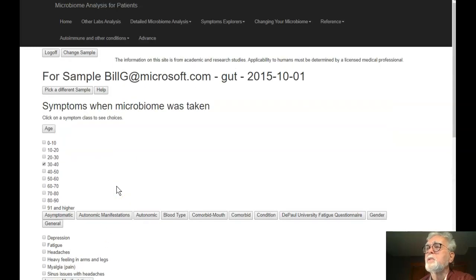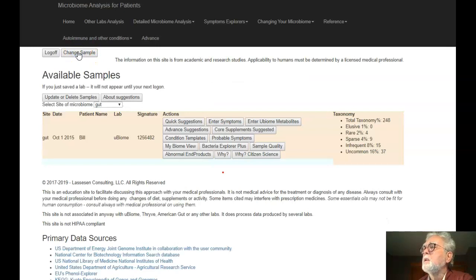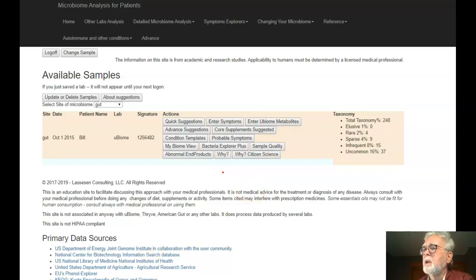The prediction is based on you, a person entering the symptoms after you upload the data. The next one is enter UBiome metabolites — I have a separate video on how to do that. I'm just going to take a look at what the resulting data screen looks like.